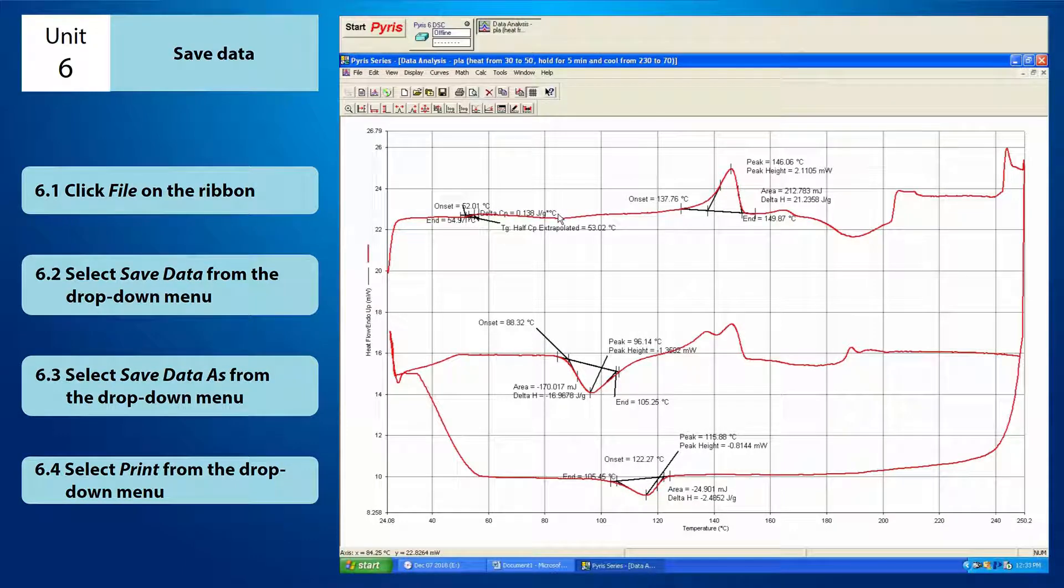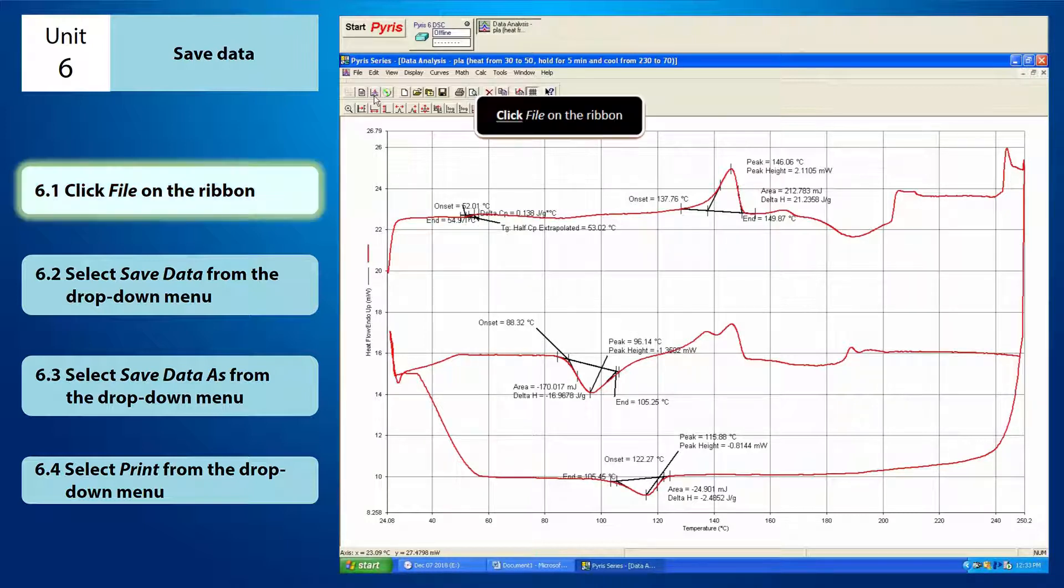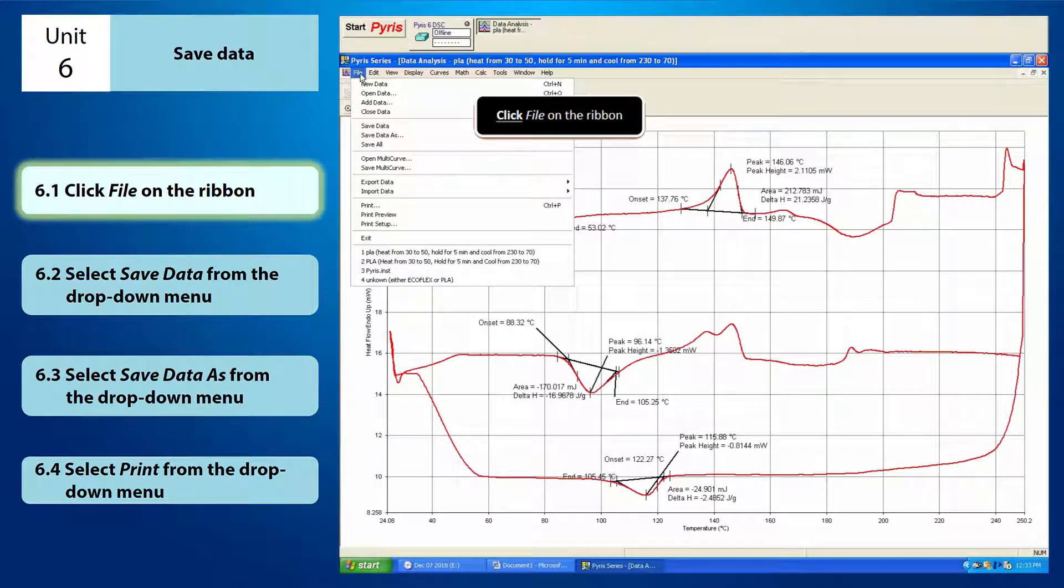Hi everyone, this is a tutorial video on how to save your data from the instrument viewer. First, you need to click file on the ribbon.